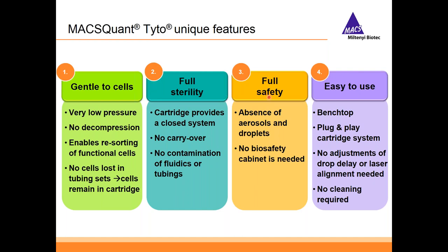We have a safe sorting environment as we're not producing aerosols or droplets. And therefore, we also do not need a biosafety cabinet. A small biosafety cabinet is already the cartridge, as it is a closed system.